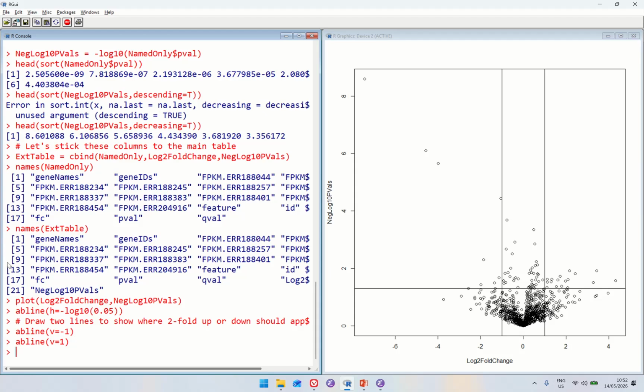First off, we put in a horizontal line at the negative log 10 of 0.05. That is this line right here. I've actually kind of committed a sin here to make the data look pretty. I apologize. But I'm showing p-values rather than the q-values that they computed for us. This should probably have been q-values. I didn't update the script though.